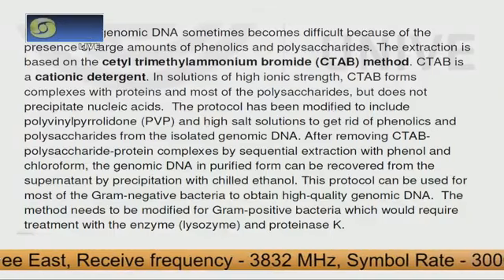So when you are preparing the extraction buffer, make sure that it has the CTAB together with the PVP. So you have to prepare the extraction buffer containing these particular chemicals, that is the cationic detergent CTAB, together with the PVP.